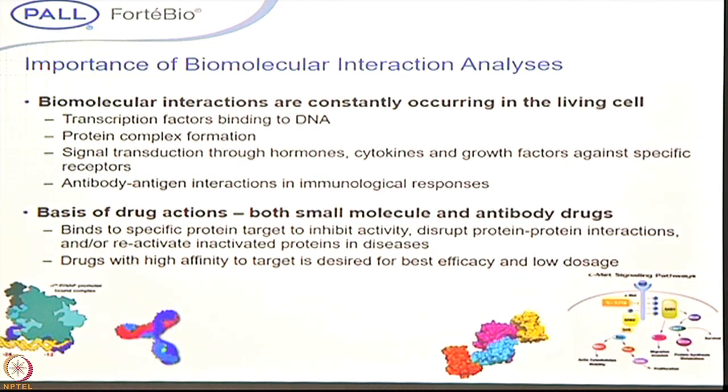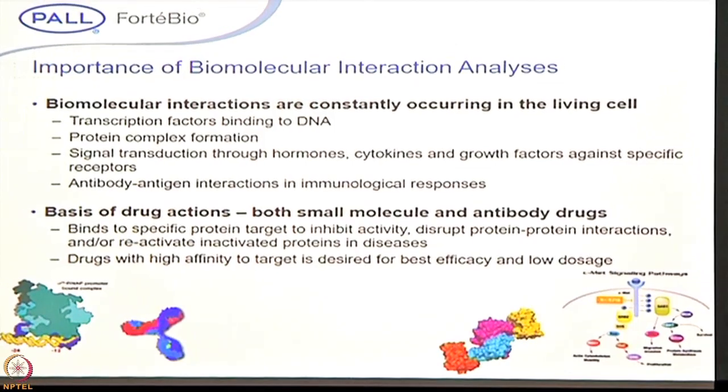Even when it comes to drug discovery, we want to understand the mechanism of interactions, how the drug is binding to the particular target. When we are discovering such molecules, we have to look at the affinity. When it comes to the dose, I can give a simple example. Some drugs you have to take three times a day, some drugs once a week, some once a day. So how does the dose get decided? These doses depend upon the interaction platforms.